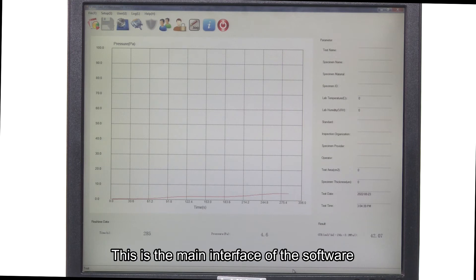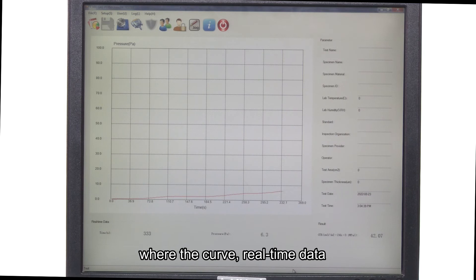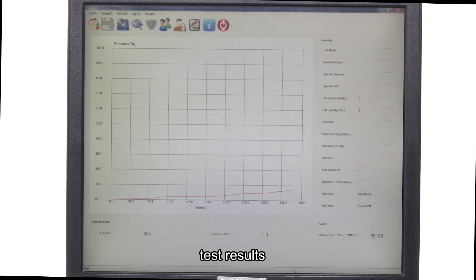This is the main interface of the software, where the curve, real-time data, test results, and parameters will be displayed.